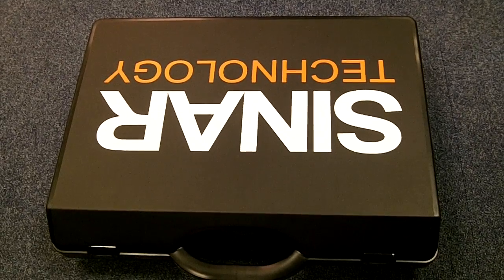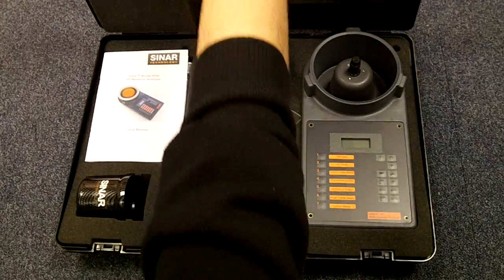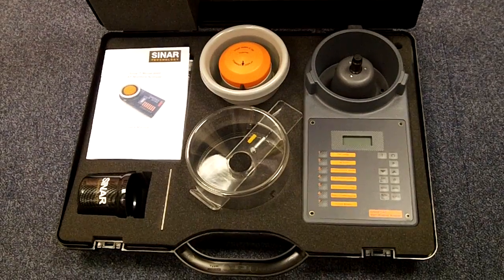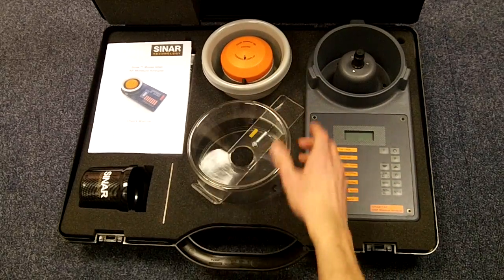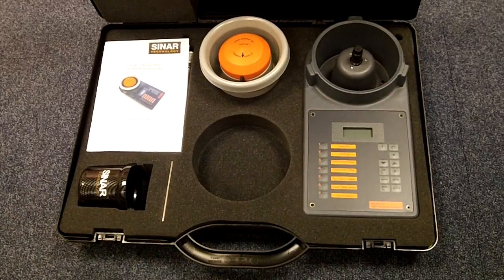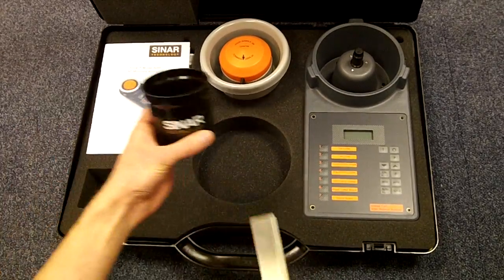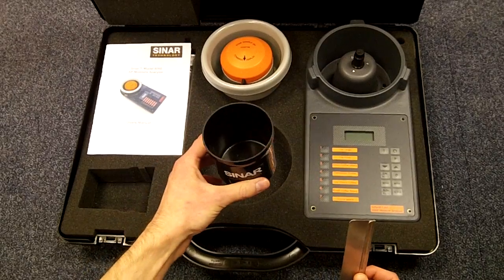This is the AP6060 from Sinar Technology. Inside the carry case you have the main body of the machine, the sample cell, the filling hopper for loading the sample into the instrument, the sample beaker and a strike off blade. This gives you the correct sample volume for the instrument.